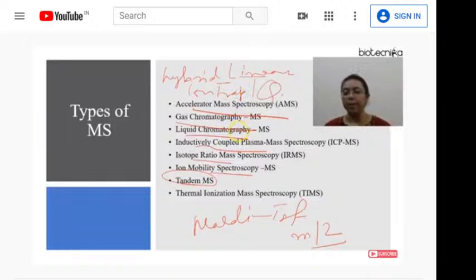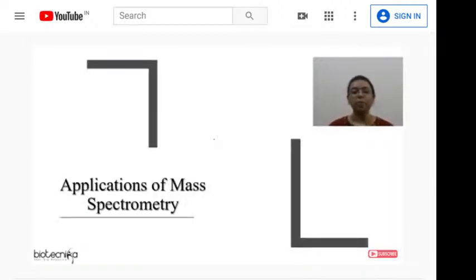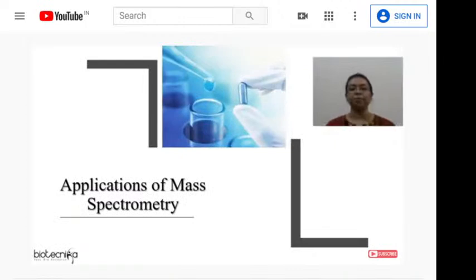In this, the MS combines a linear ion trap and a high resolution orbitrap, which is one of the tandem mass spectrometers. The orbitrap consists of an axially symmetrical mass analyzer that makes the ions move in an orbital motion around the spindle. These are all high definition mass spectrometers, and they are definitely very costly. But yes, the precision you get is excellent with these techniques.